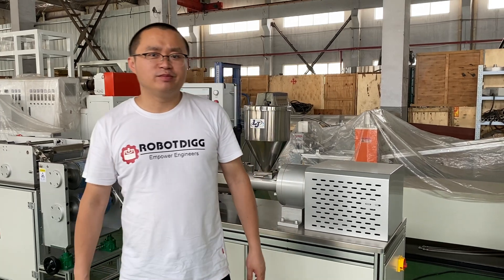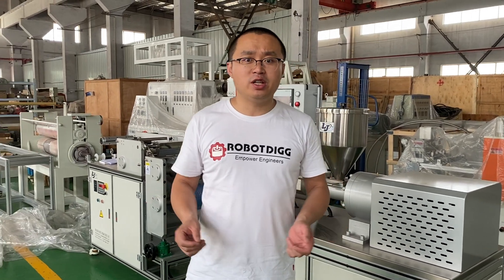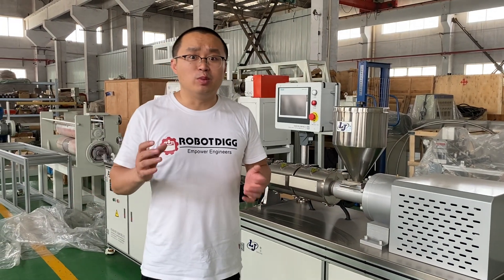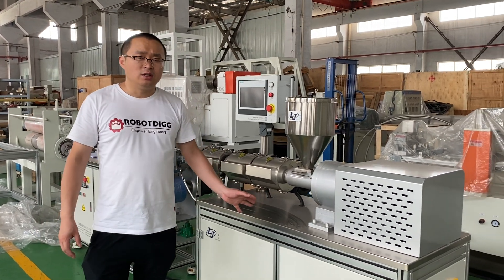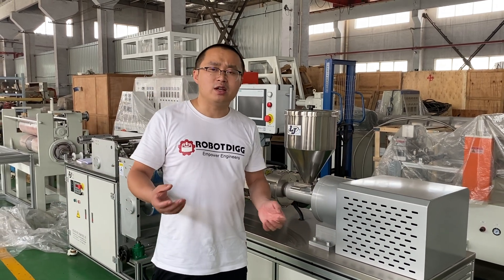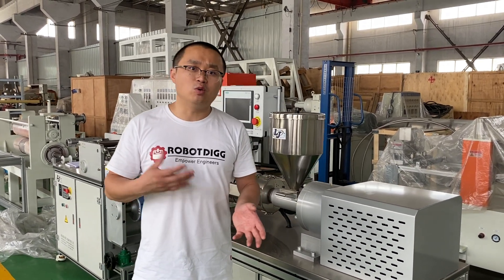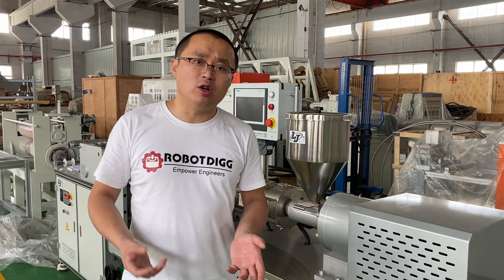Hi, this is Tiger from Robody. Before this video, I showed you the blow film machine. Compared with the blow film machine, here you can see the cast film machine. The cast film machine performance is much better than the blow film machine if you want to check the characteristics of your material or pellet.